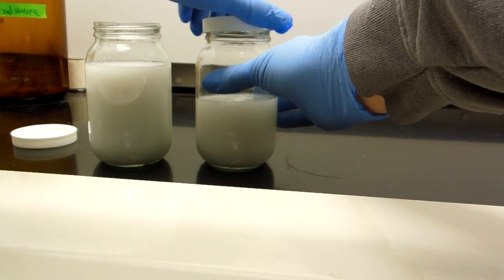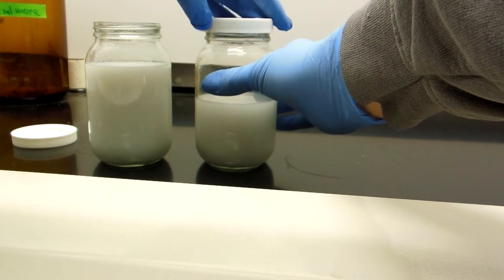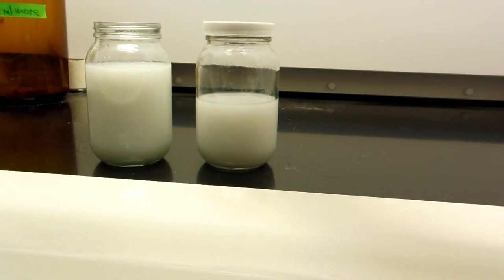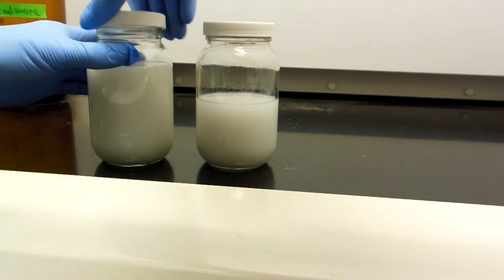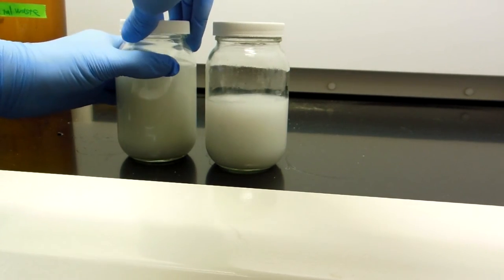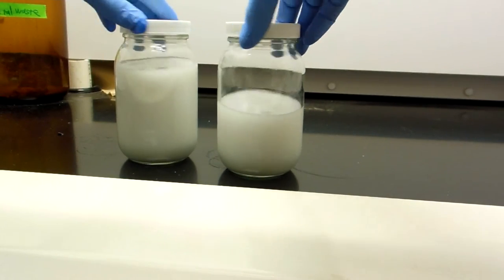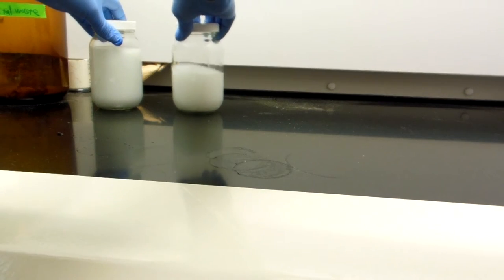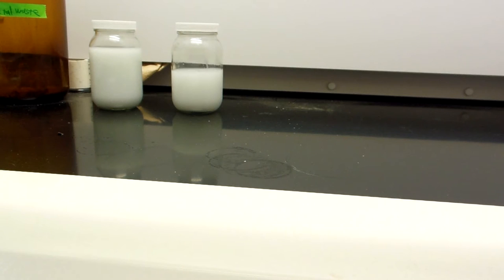So, I replace the caps on both. And I will slip on the second jar when screwing it in. And that shows how important gloves are in this case. I let those jars of the precipitated silver chloride set overnight, and the next week I will check the solutions in the jar.